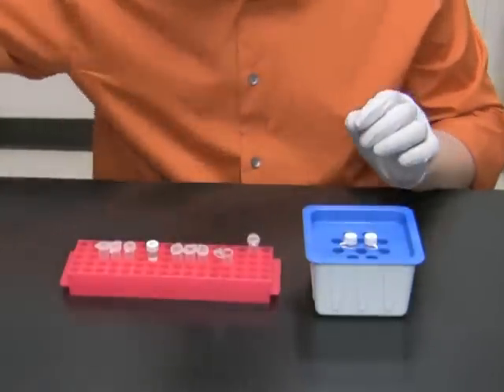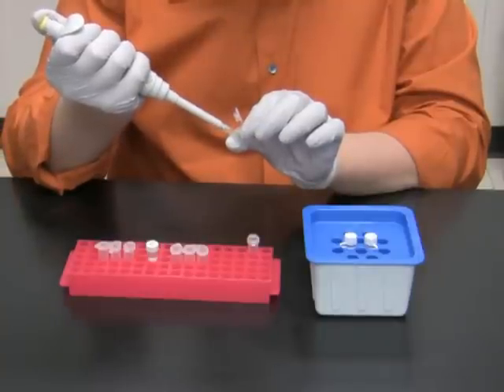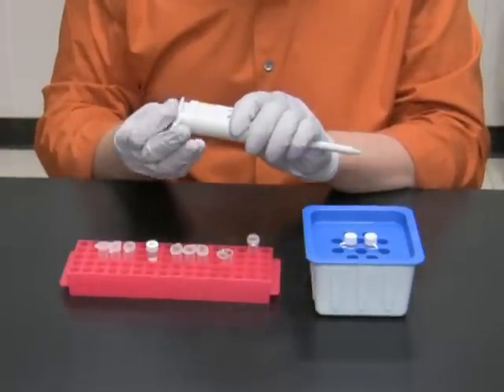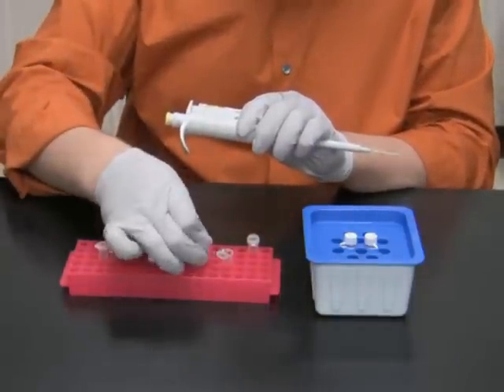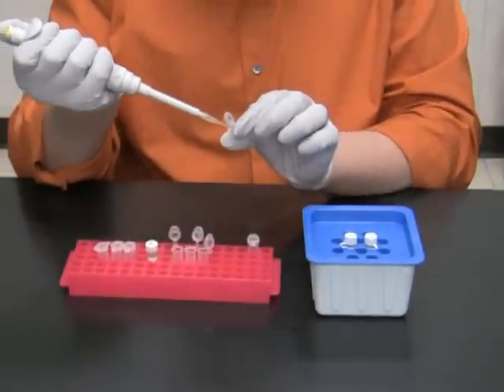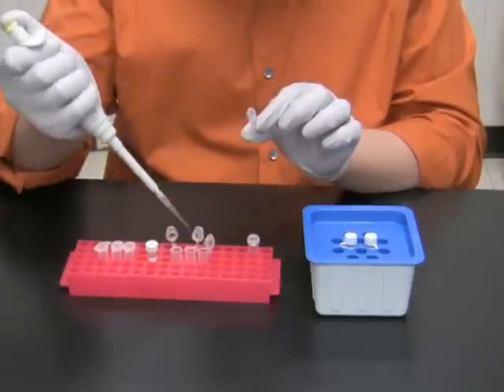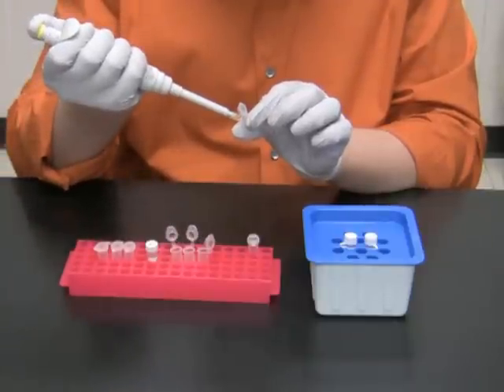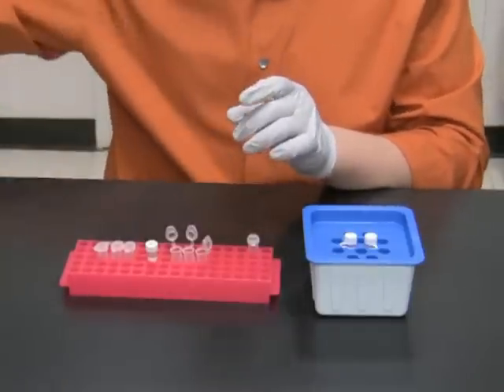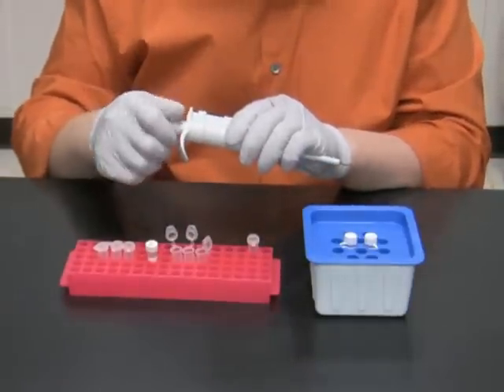I will mix up the master mix and put 19 microliters of it into each of the new tubes. Then I will add 1 microliter of plasmid to each of the reaction tubes and mix it up by pipetting.